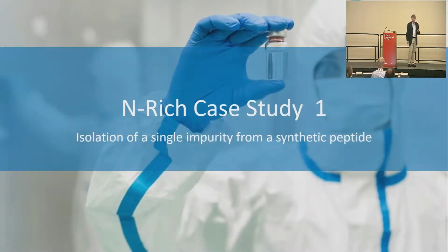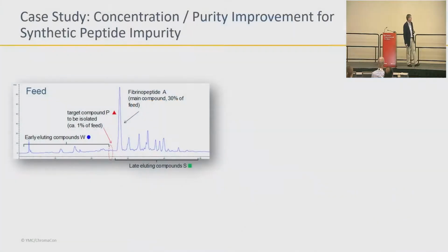All right, which leads us into our first case study, and this is obtaining a dilute single component out of a mixture. The peak that we want is this peak.